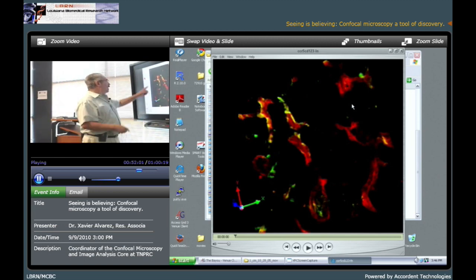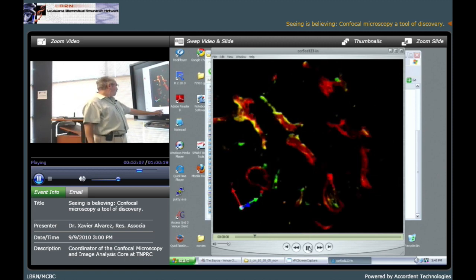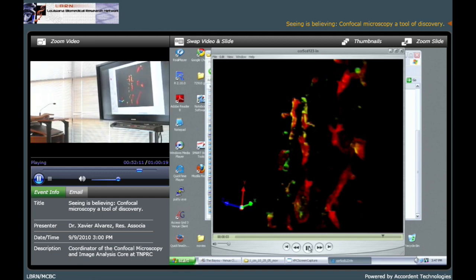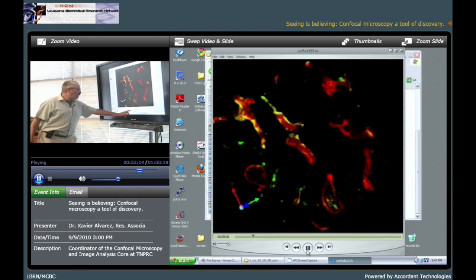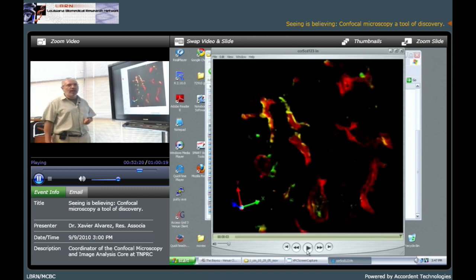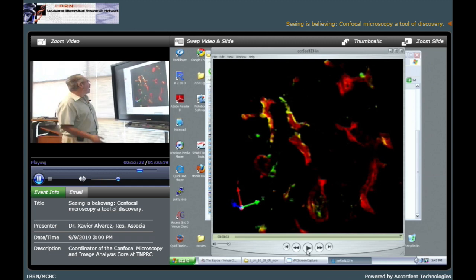This is the presence of the receptor in dendritic cells. And you say, oh, what's that? Then we could demonstrate that those cells get infected with the virus of AIDS. And I think that's enough.